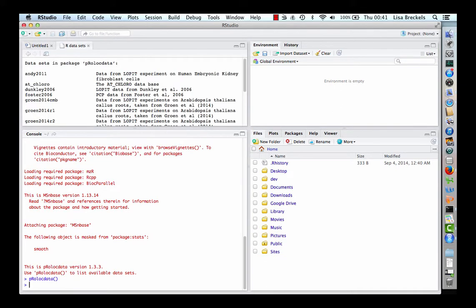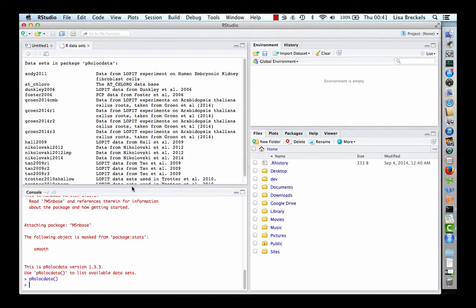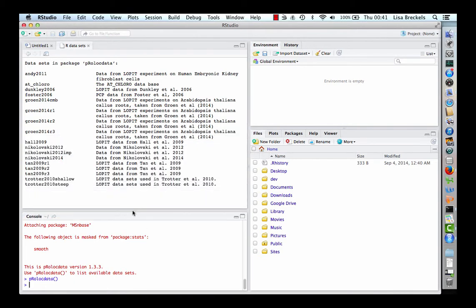A tab opens in the editor window, which you can see in the top left-hand pane. Here we have listed the number of different datasets available to load.